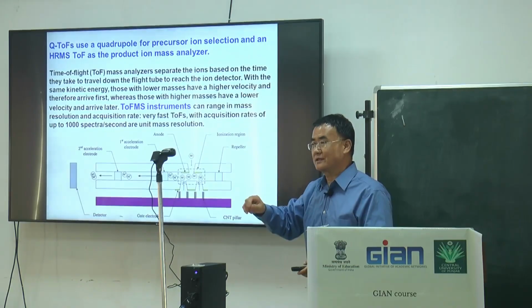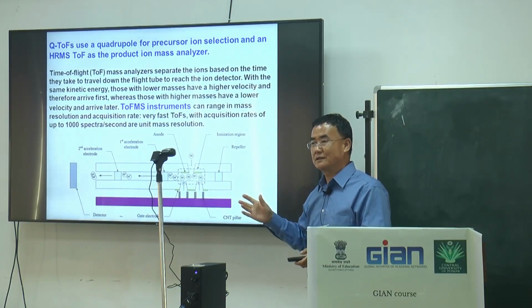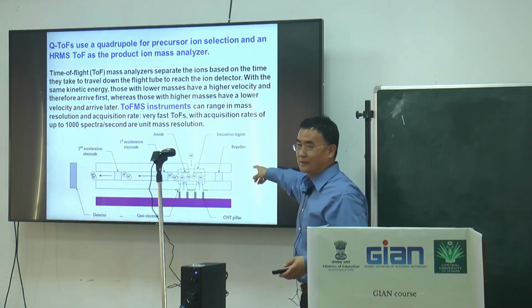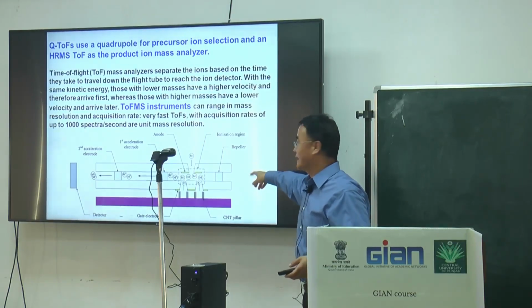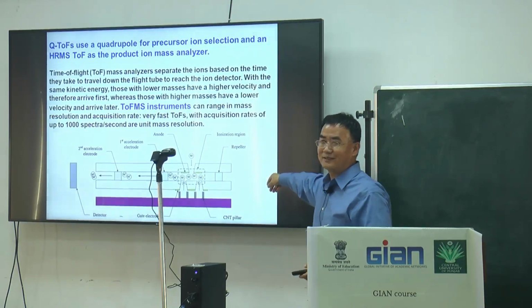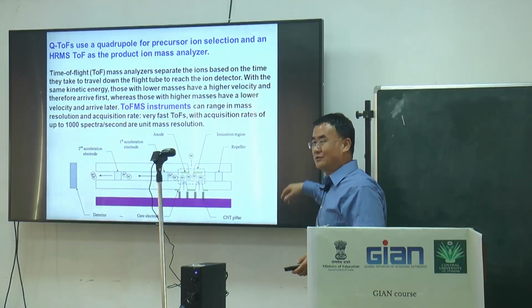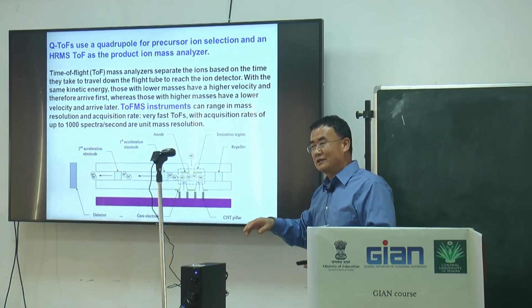After centrifugation, we do the membrane filter to remove other large particles, because large particles will destroy the injection part, so it protects the machine. Even in HPLC, we still use the 0.22 micrometer pore.